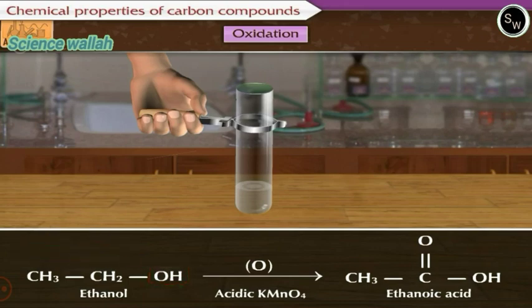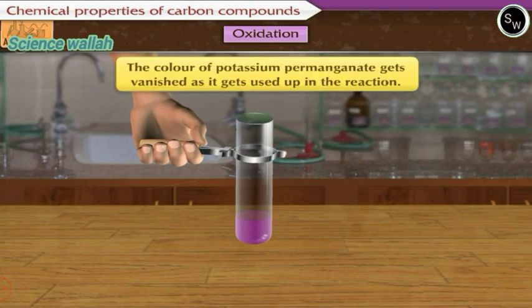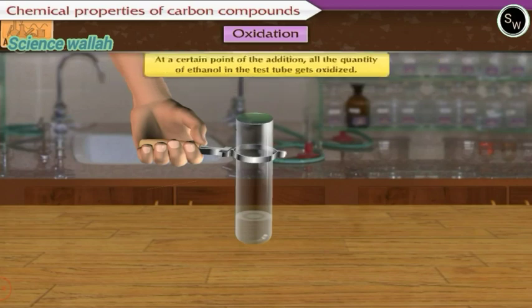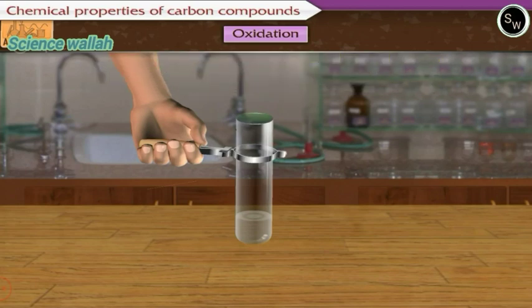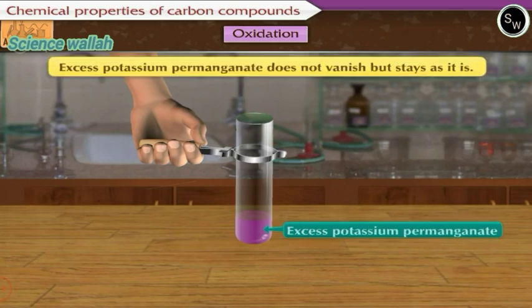On starting drop by drop addition of potassium permanganate in ethanol, the color of potassium permanganate gets vanished as it gets used up in the reaction. At a certain point of the addition, all the quantity of ethanol in the test tube gets oxidized. If we continue the addition of potassium permanganate beyond this point, it is not used up and becomes excess, so the pink color of this excess potassium permanganate does not vanish but stays as it is.